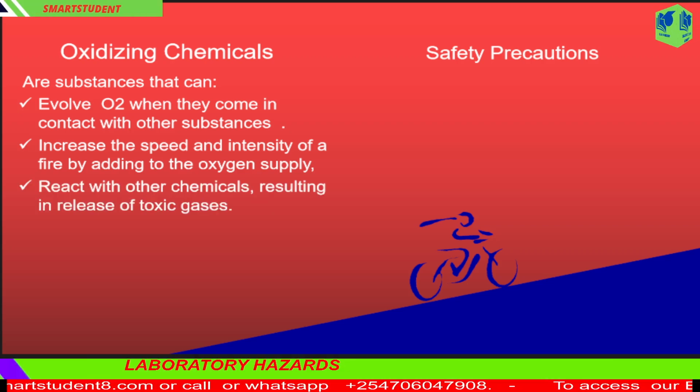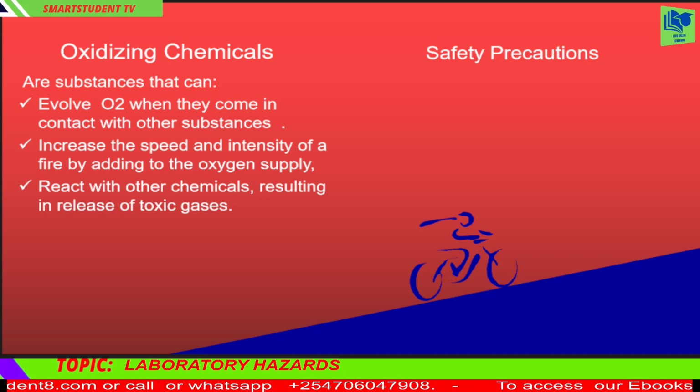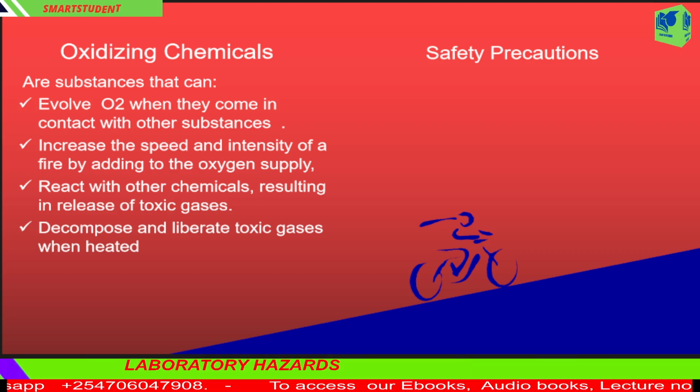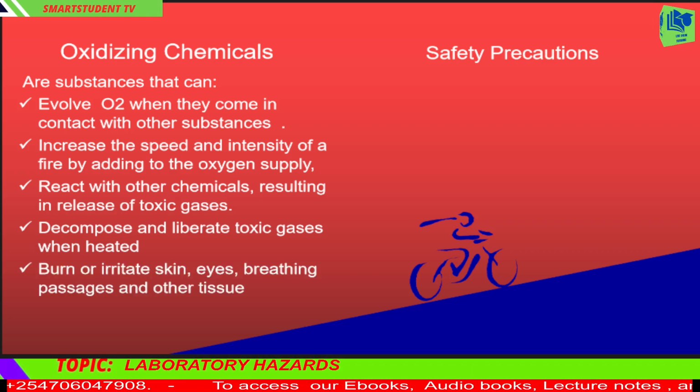Oxidizers can also: 1. React with other chemicals, resulting in release of toxic gases. 2. Decompose and liberate toxic gases when heated. 3. Burn or irritate skin, eyes, breathing passages, and other tissue.